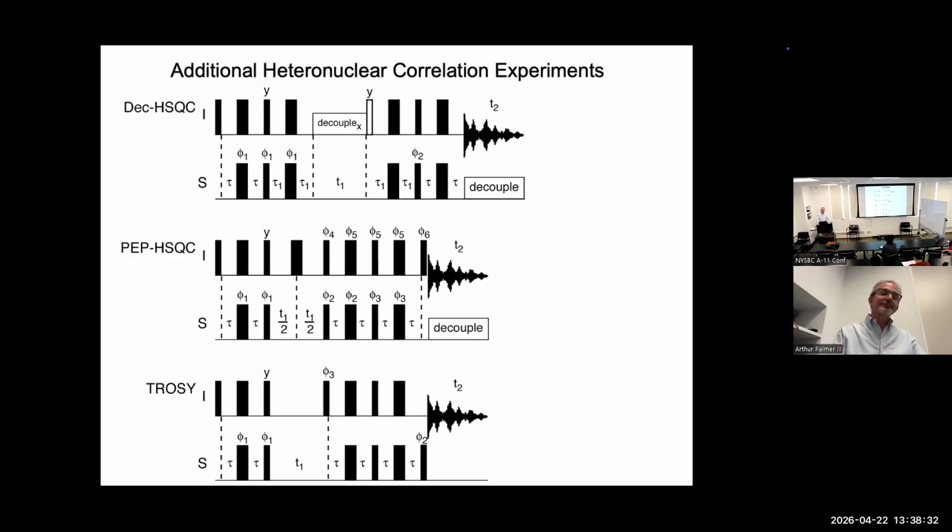But for 20 or 30 kilodalton proteins, that's not very much. So you end up gaining √2 in signal to noise, and many of the triple resonance experiments that use nitrogen as one of the transfer steps use this trick a lot. Not so much with carbon.